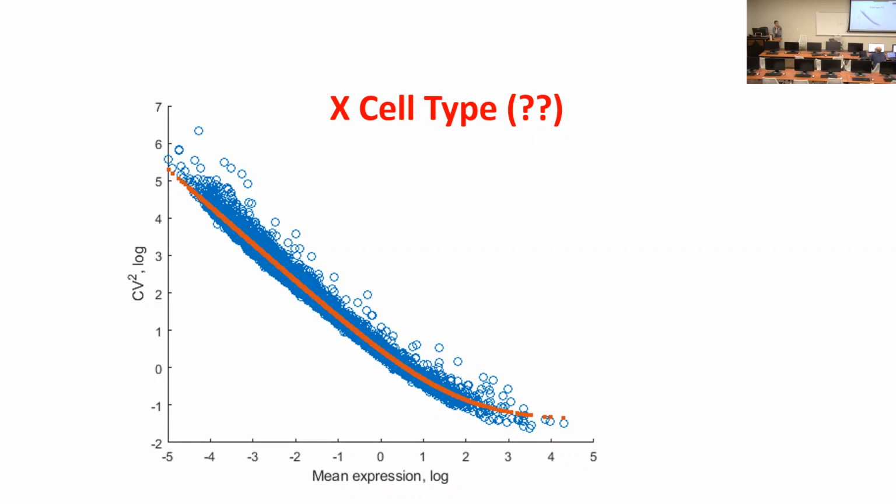All genes are present, there are a lot of genes expressed. Some genes' expression level is high, so they're healthy cells. Low variability.